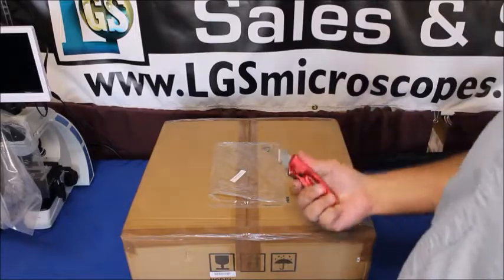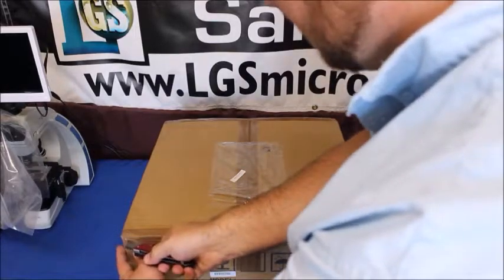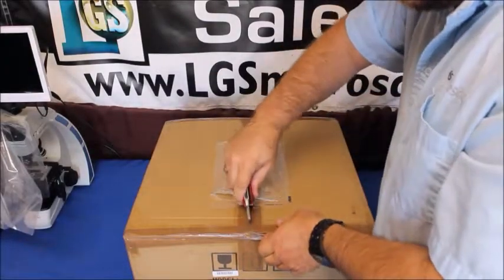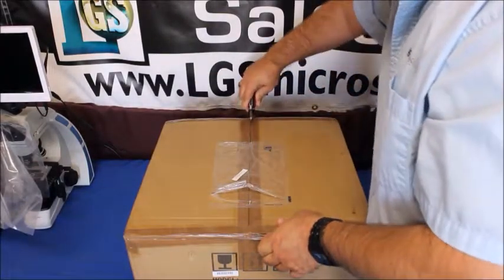First, obviously we have to open up the box so we're going to take our box cutter and obviously be very careful. I don't want to cut too deep. I don't damage anything inside.